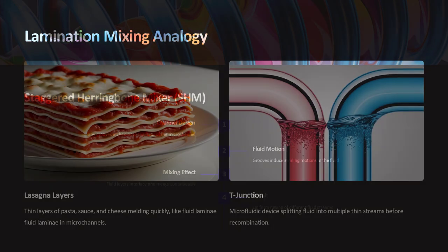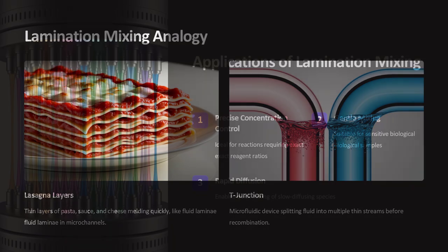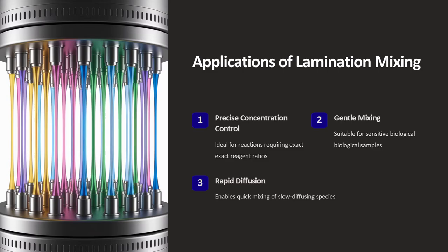In contrast, microfluidic devices function like a state-of-the-art miniature factory where every fluid element is precisely controlled and mixed uniformly. Imagine a high-precision assembly line where each component is handled with the same meticulous care, ensuring that every mini reaction on the chip is identical to the next.